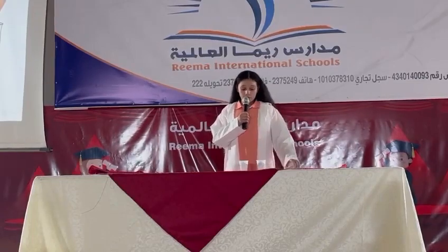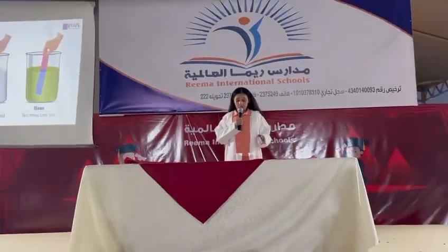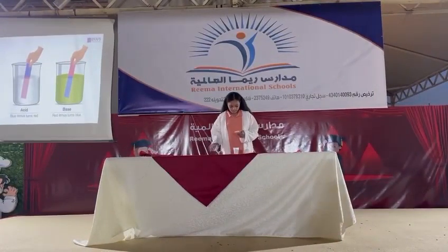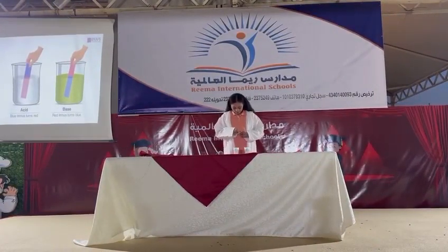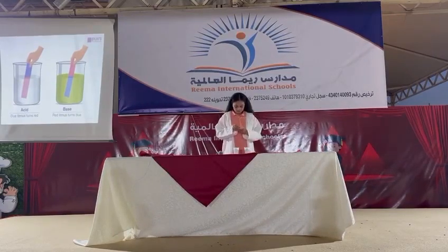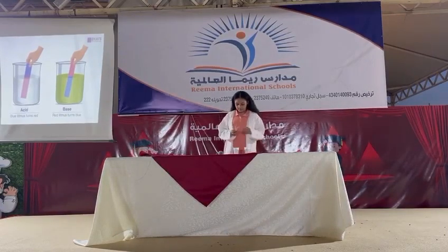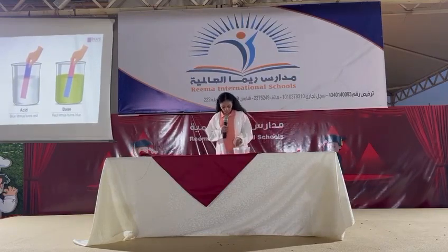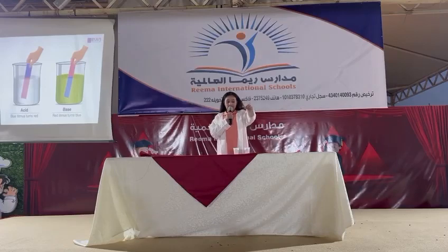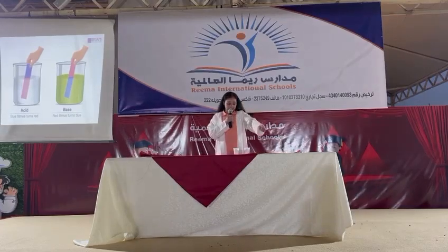Now we will put the blue litmus paper into the vinegar to check which is an acid or base. Look everyone, it turns red. That means that the vinegar is an acid.